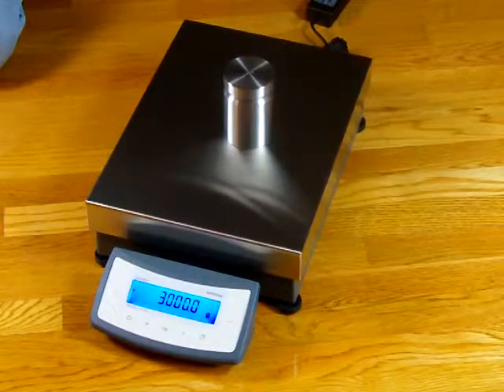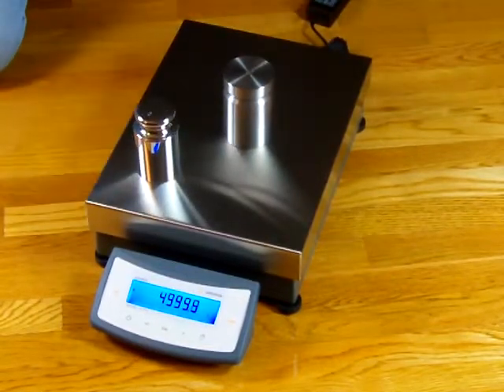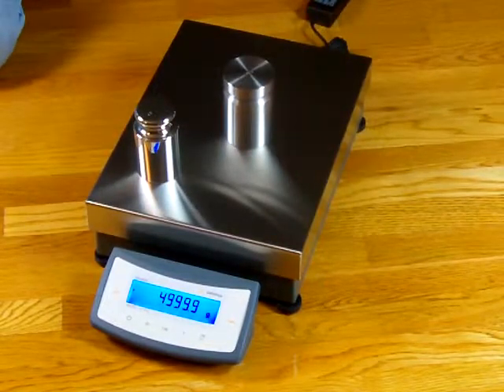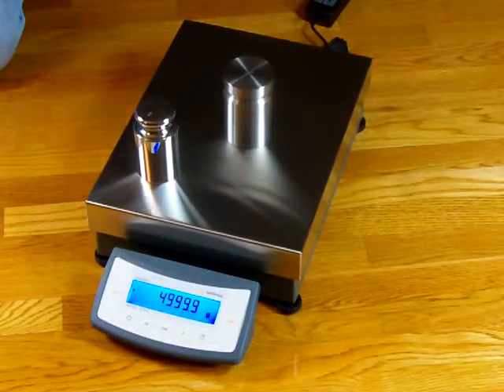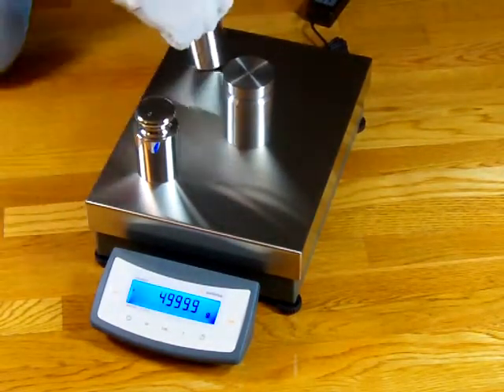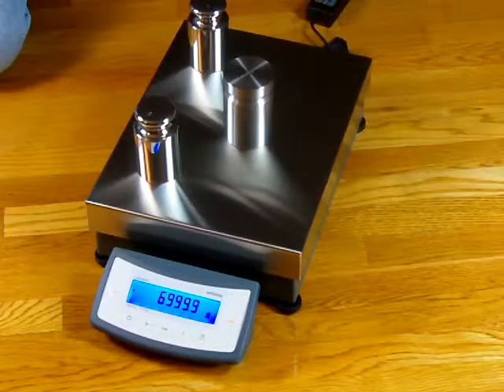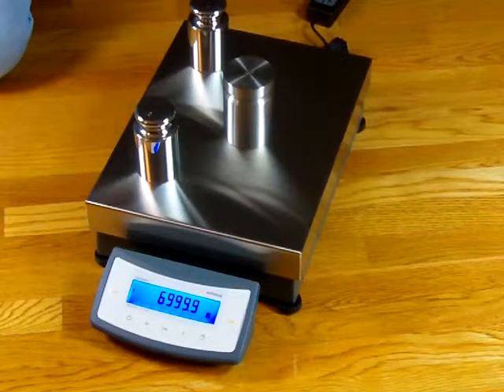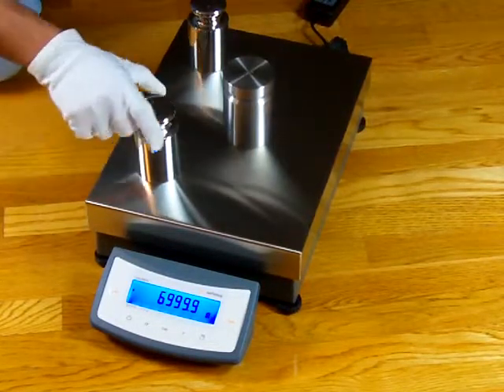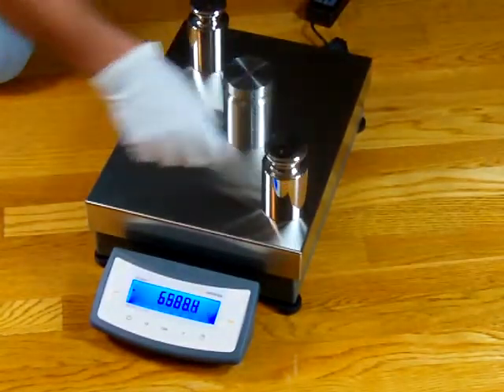Sartorius has been building balances for over 140 years — they have the most experience in the industry altogether. The balance features a nice large stainless steel weighing platform measuring 11.8 by 15.7 inches. These are some calibration weights I'm just throwing on the balance to give you an idea of the performance and speed.